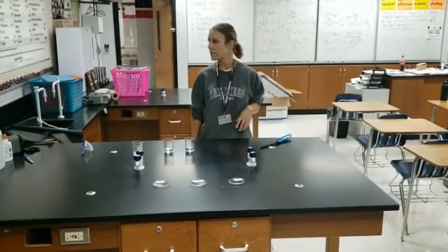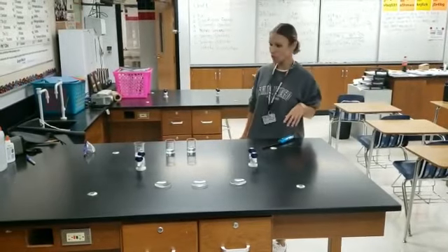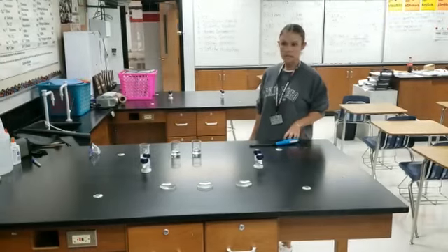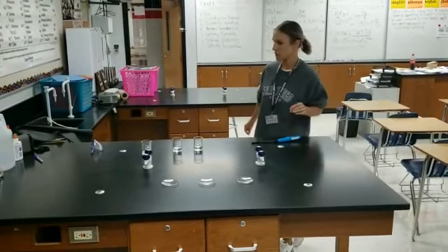Hi, this is Ms. Romanenko and we're at Hanks High School. We're going to do some chemistry today. Today I'm going to give you a basic safety demonstration and some observations with different liquids.